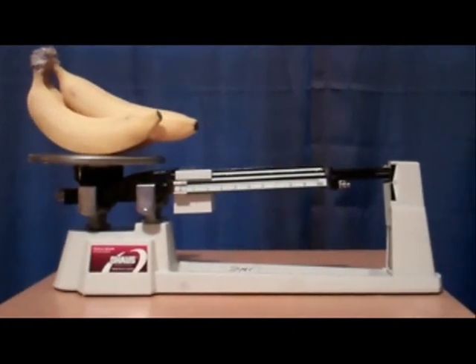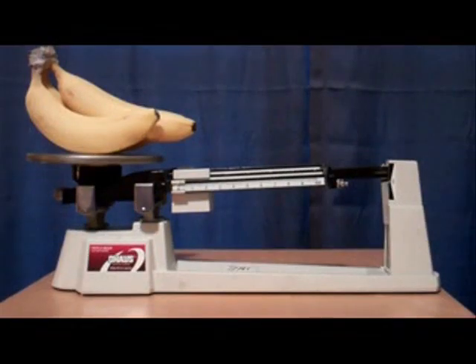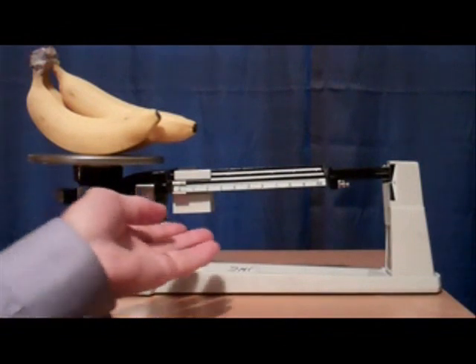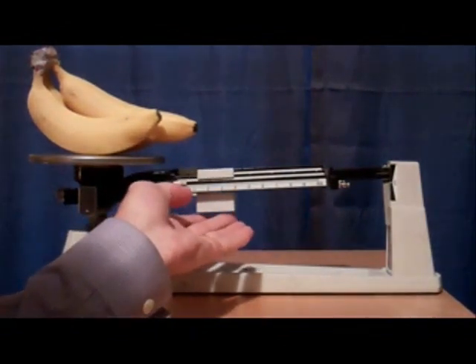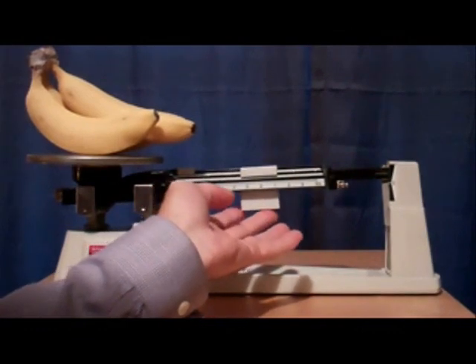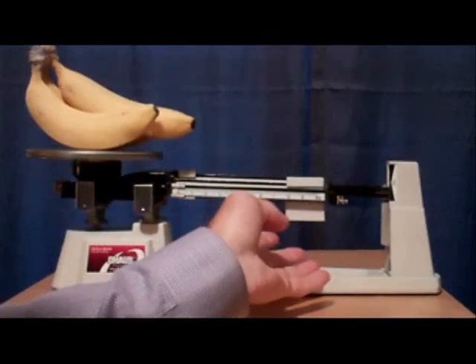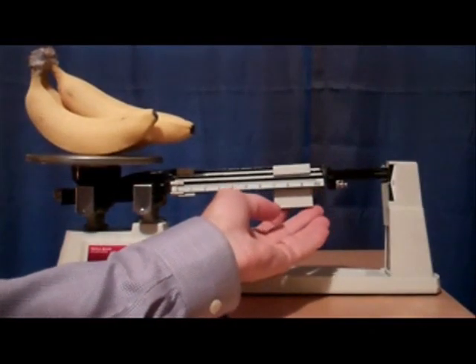Beginning with the biggest of the three riders, move the riders into the slots until the scale tips. Then back up one slot. To find the mass, I need to move each of the riders, starting with the big one, until the scale tips. Make sure the rider falls into the slots as it goes. Oops, that's too much, so I'll back it off one.